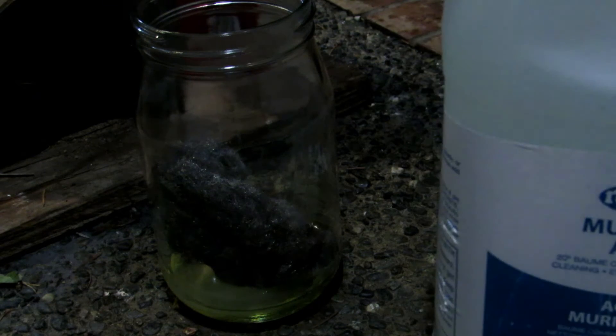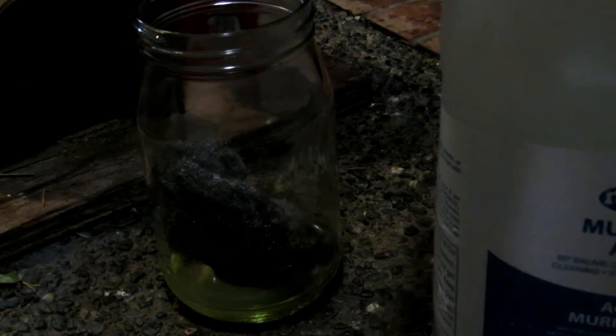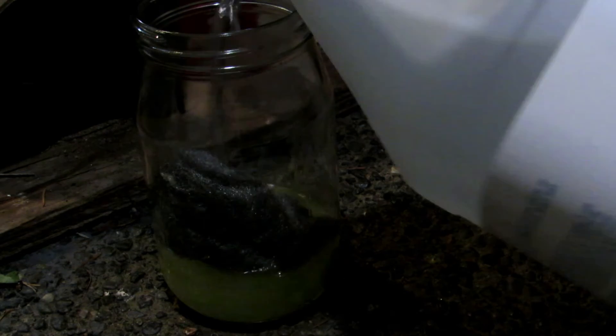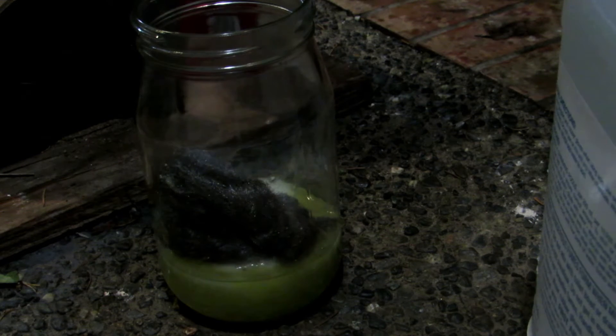You can see the vigorous reaction happening. I went out and bought another 4 liters of hydrochloric acid, so we can now finish the reaction by adding in a bunch more. There we go — that seems better. We'll just let this sit and fully react until all the iron has been dissolved.